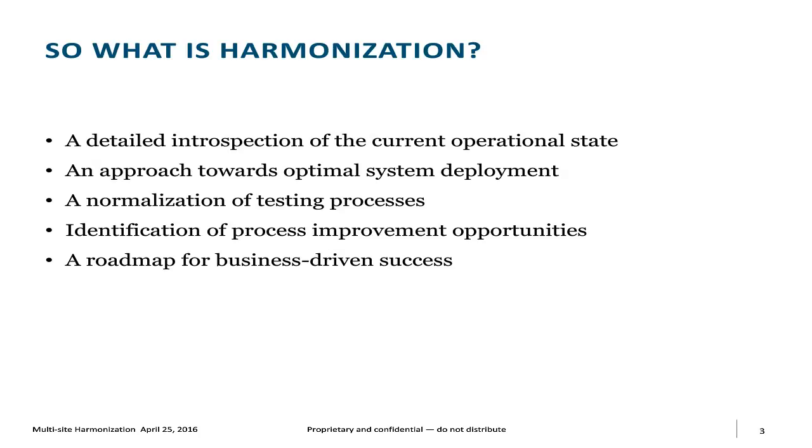What we do want to do is understand that harmonization and workflow analysis not only deal with things that LIMS brings to the table, because process improvement will only partially involve any software that's brought to the picture, but also looking at a chance to improve operations in any kind of environment. Every time over the years that we've done current state environments and worked through this process, people understand that there are process improvements that we have identified with the help of our users, our customer experts, that bring some sort of relief to some of the bottlenecks in the processes that previously were never addressed.